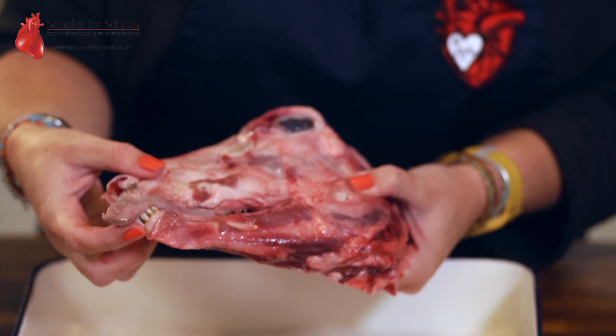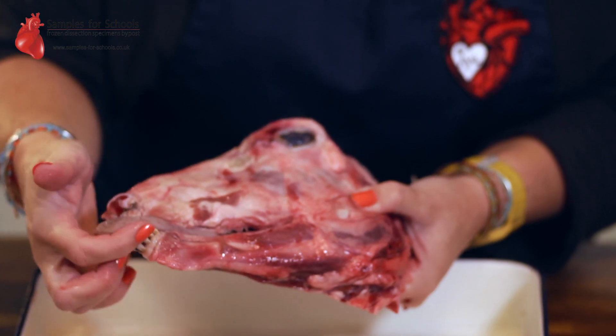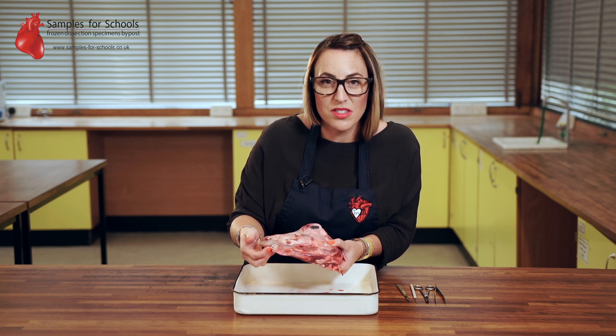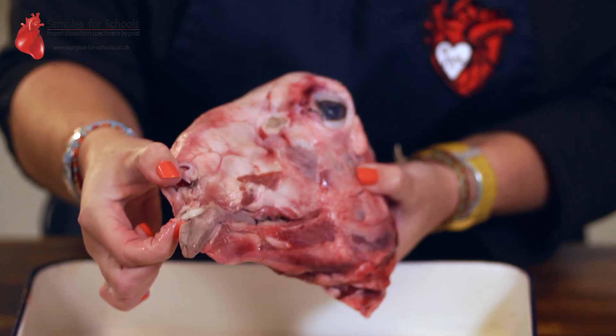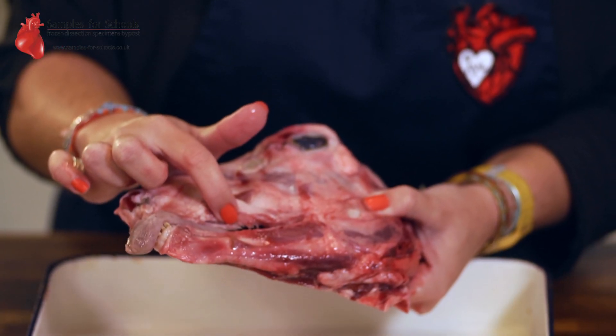When you look at your sample you'll notice that it has no front incisors at the top, only at the bottom. This is because the sheep is a ruminant and it uses these bottom incisors against a dental pad to nip the grass, with its back teeth to chew the cud.